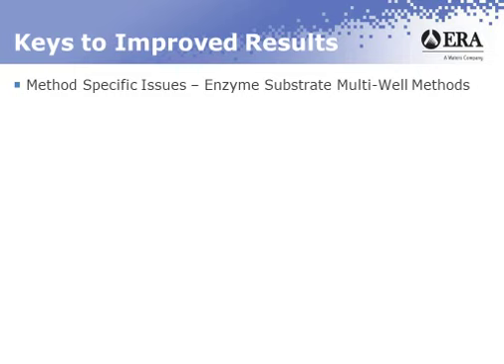Okay, keys to improve results specifically related to enzyme substrate methods. A lot of you are probably familiar with Quantitray. This is an area where I want to try to address some of those issues.